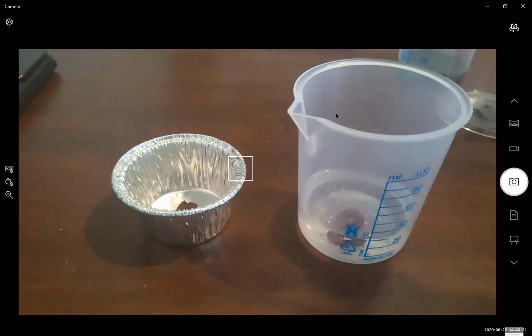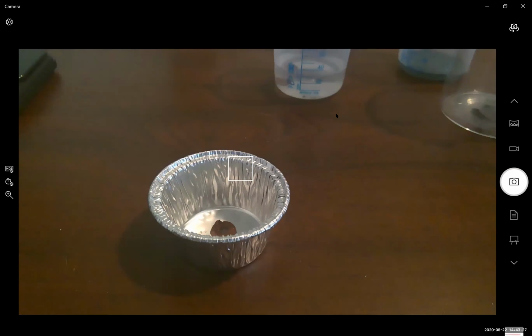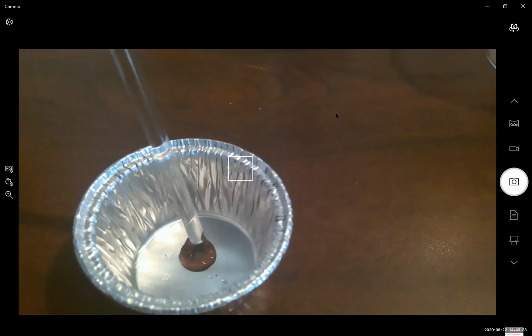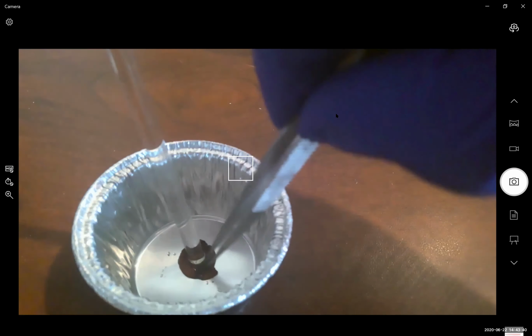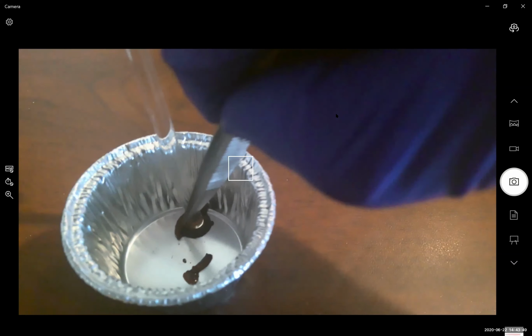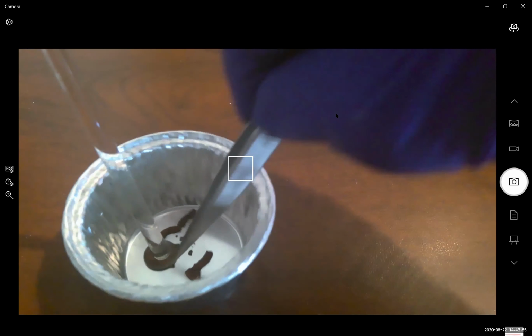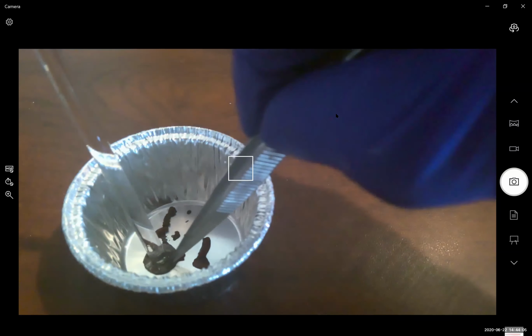Okay. Now, what we're going to do, and this is a little bit tricky, with one of our pieces, we're going to pin it down with our stirring rod, and use our forceps to scrape the copper off. Sometimes these things just fall apart, but we're going to scrape the copper off as much as we can. Just do as best of a job as you can. It should fall off. Should be almost smooth as butter. If it's fully reacted, the copper should fall off pretty quickly.